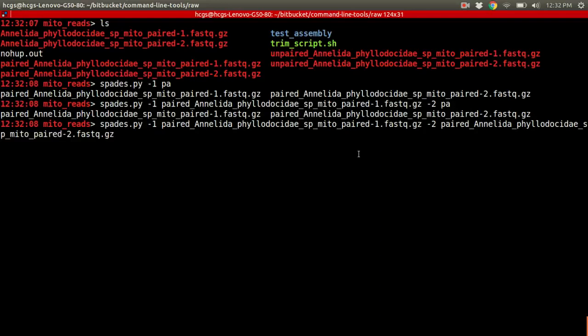Something I'd like to point out is that you might get a lot more reads than just a single set, and that's when you're going to have to use that concatenate option, which I covered before. You're going to want to concatenate them into a single set of forward and a single set of reverse reads if they're coming from the same run in the same sample. You shouldn't mix reads if they're from entirely different things unless you know what you're doing. So make sure they're in that format so you can just do a -1 and -2 here. That's not required. You can specify multiple libraries and have multiple files, but that's kind of a pain, I think. So I would rather just go ahead and concatenate them ahead of time.